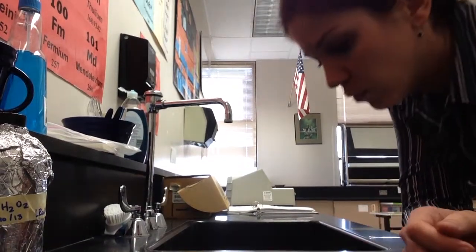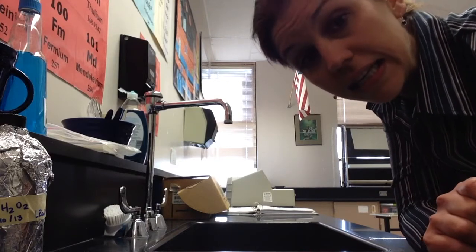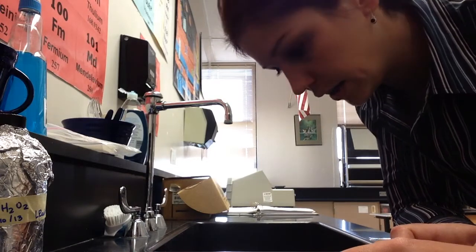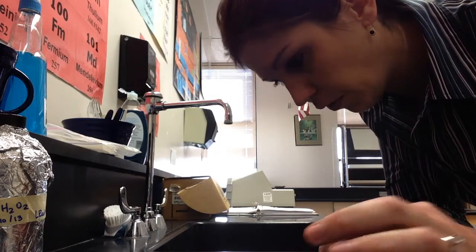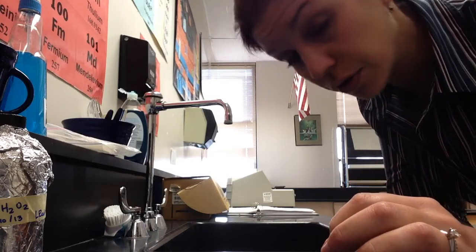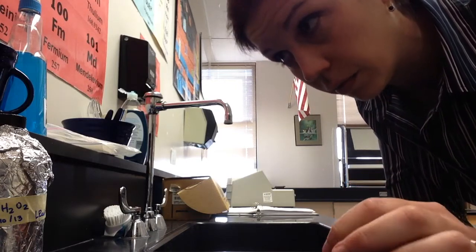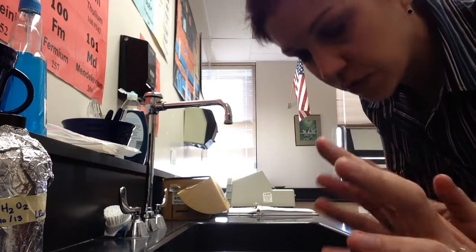Hi guys. One of the things with this lab is that we have to measure out really teeny tiny quantities of a liquid, a couple different liquids, and we have to measure out those quantities in terms of microliters. A microliter is 1/1000th of a milliliter, and so for this lab you have 0.2 milliliters or 200 microliters, and then 0.3 milliliters or 300 microliters of substances.